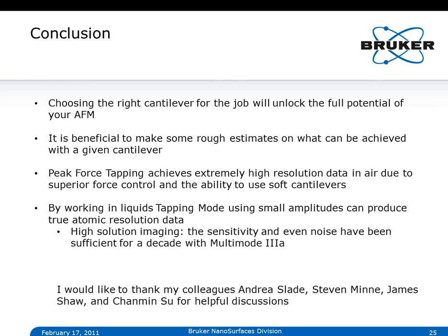Tip wear can be caused by a few things. One thing is, of course, that something gets messed up and your tip makes hard contact with the sample, and then either your tip or the sample gives, and something breaks off your tip, and then your tip's not as sharp as when you started. As a matter of fact, what's interesting to look at in tapping mode is often the approach. The very first tap to the surface snaps off a small part of your tip.